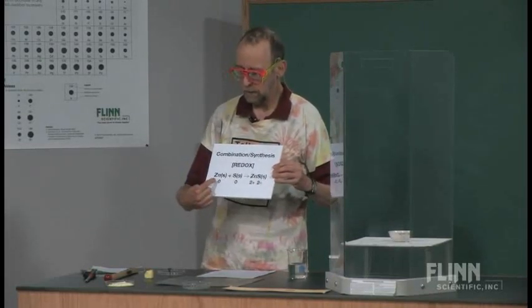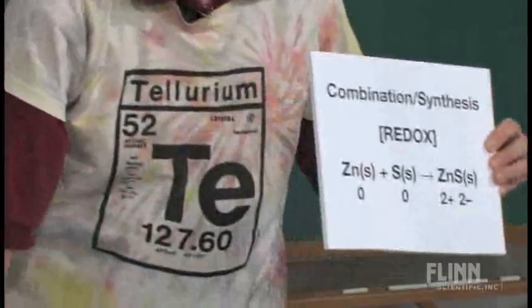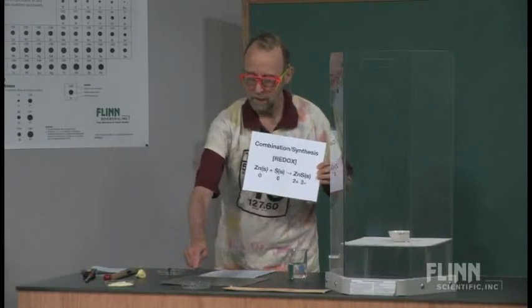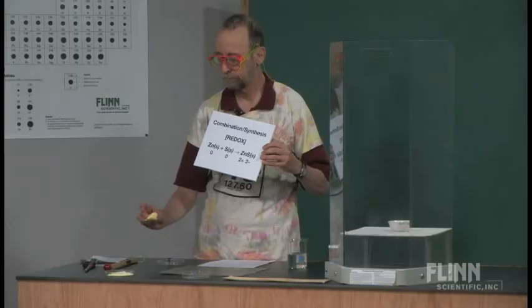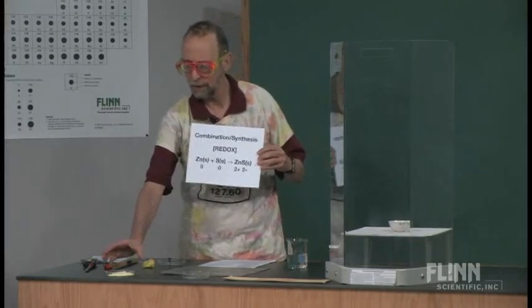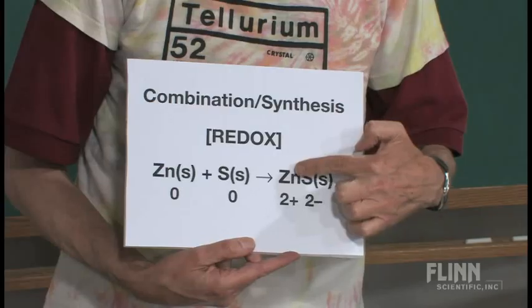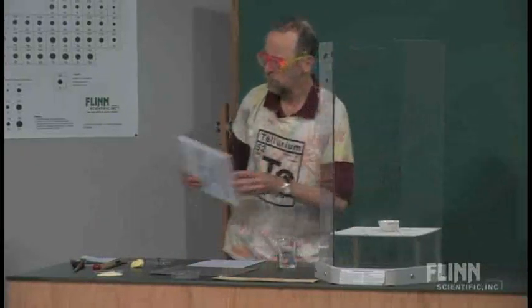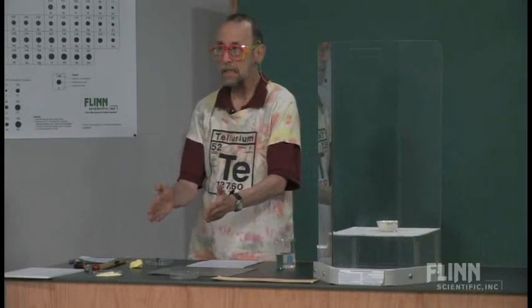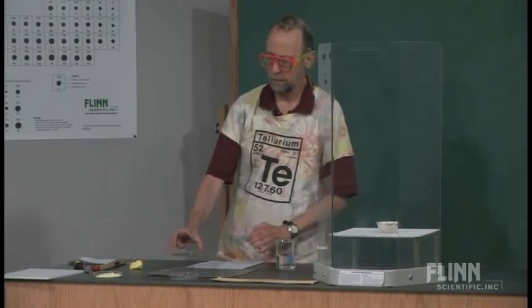If you think about this, the one that we're going to do, we're going to take a lovely chunk of zinc right here. This is a big piece of zinc, zinc metal. I can touch that with my hands, not a problem. Here is some zinc powder, which I'm not going to touch with my hands. Here's a lovely chunk of sulfur. That's nice. Here's some flour of sulfur. Both of these have an oxidation state of zero. They're elements. And we're going to produce, or yield, some zinc sulfide. And here we have an oxidation state of two plus and two minus. That's our goal for this particular experiment, to do this redox reaction, or this synthesis reaction.